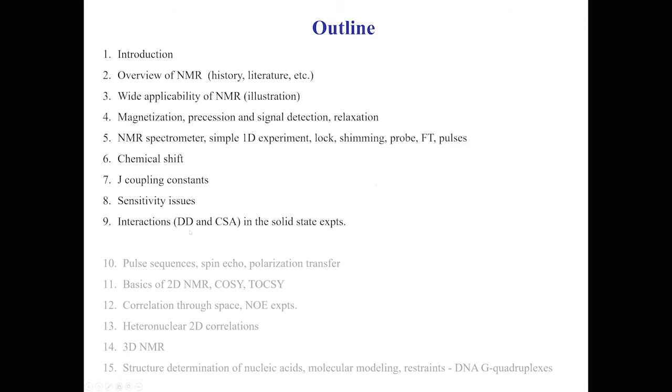And then, as this had the subtitle solid state, Professor Mali will give more detailed information on materials. I just introduce two of the interactions, dipole-dipole and chemical shift anisotropy, towards the end of the talk. The next talk will be more biologically oriented, going a little bit deeper into multidimensional techniques and other techniques.